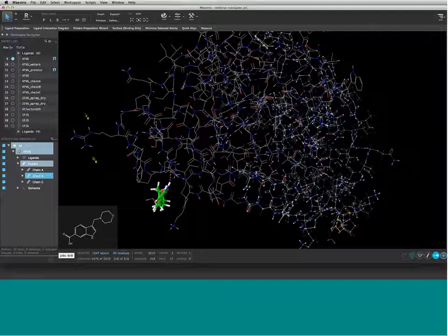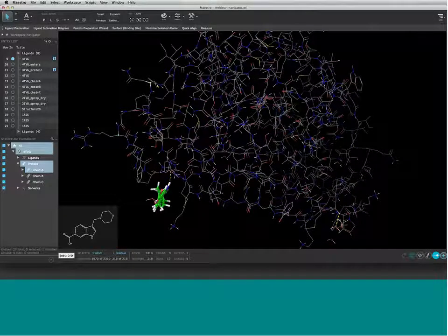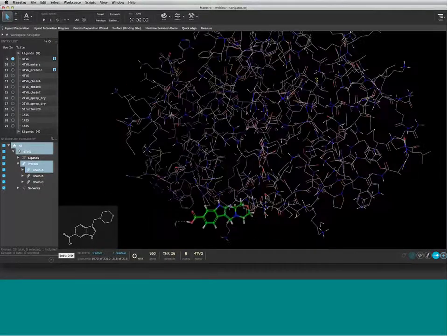And the double clicking works with other modifiers. So for instance, if I double click my residue and I want to double click another residue and keep them both selected, I can shift double click, and that still works. And if I am in subtractive picking, I can double click to deselect. So basically, all the modifiers work with the double clicking, and that can really speed your actions. You don't have to keep changing your residue mode.